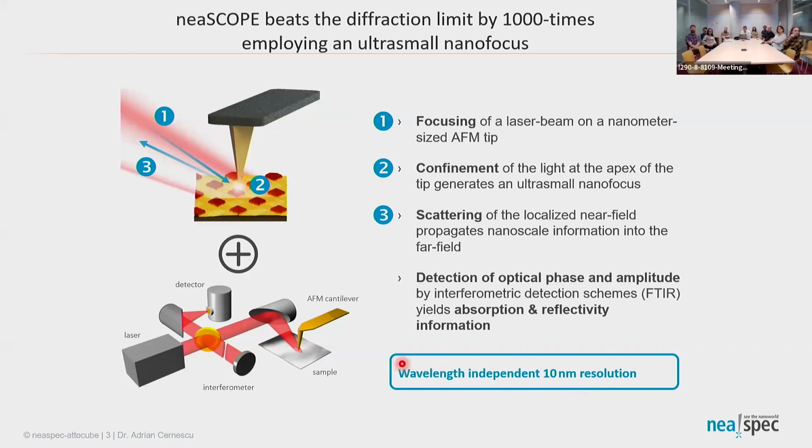And it doesn't matter which wavelength you are using in this setup. It can be infrared, but at the same time, it could even be visible light or terahertz. The spatial resolution of this measurement is given by the tip radius.